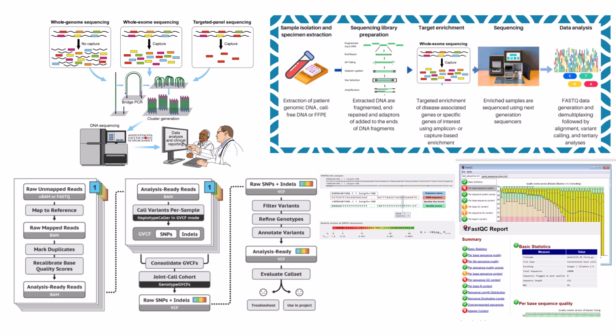It also often leverages parallel processing, analyzing multiple samples at once, or using multiple computer cores or threads for single intensive steps to dramatically speed up the whole process from days or weeks down to hours. So this automation is just fundamental to getting these results back in a clinically useful time frame.